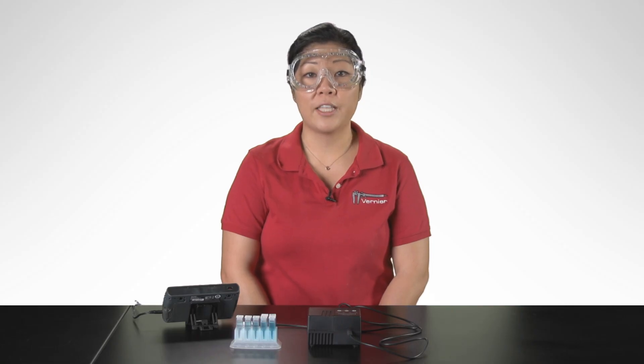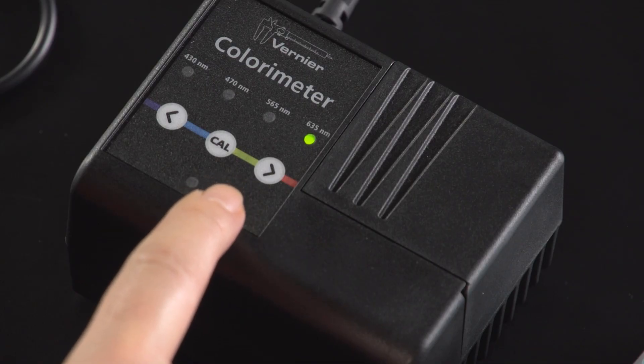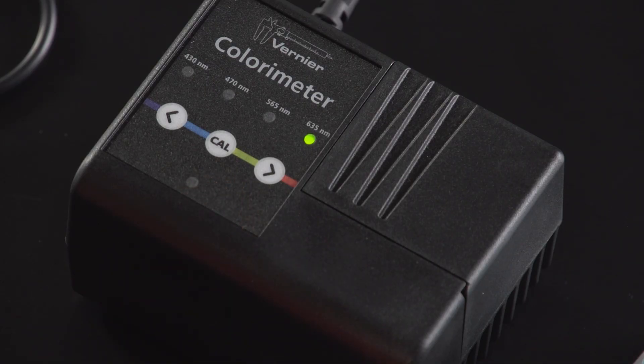Let's take a look at the features of the colorimeter. A colorimeter measures the absorbance of a particular wavelength of light by a solution. There are four wavelengths to choose from. Use the arrows to choose from these wavelengths: 430, 470, 565, or 635 nanometers.